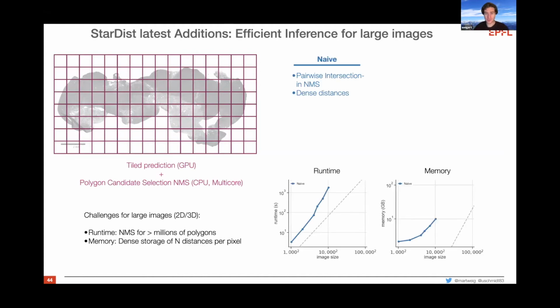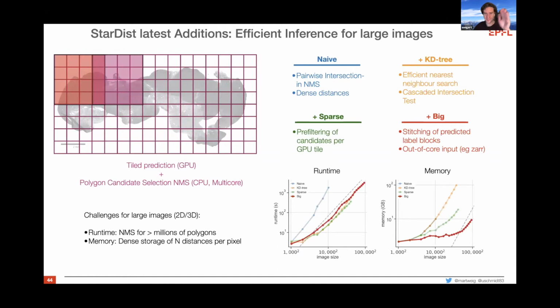And this is just to show you this succession of runtime and memory as it goes down. We put it into smaller tiles that we use for the GPU and larger tiles that we use for the NMS. Then we predict on overlapping blocks and stitch back together everything that is predicted twice. Which is not trivial, but can be done by doing this NMS on overlapping blocks and stitching them back, and making sure that you don't get strange looking artifacts at the border of those blocks.